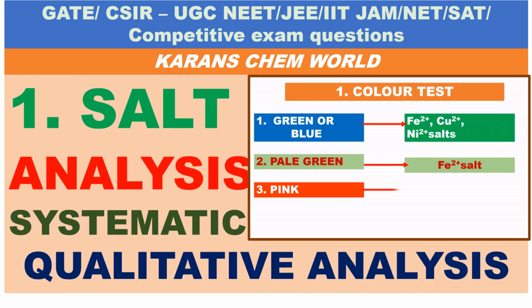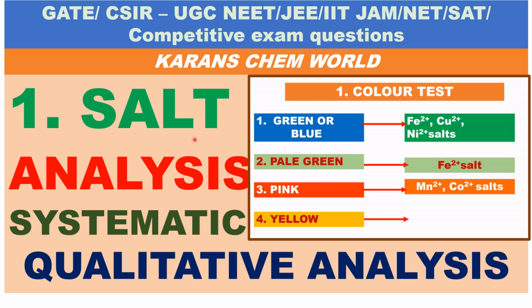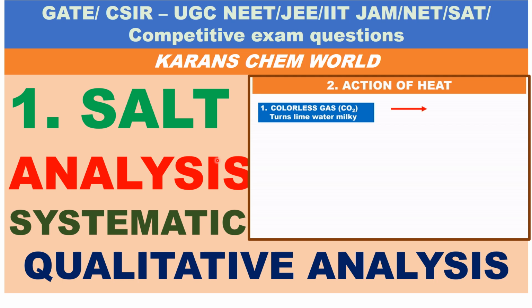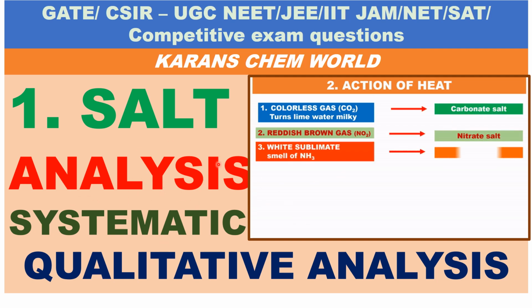Today in this video, let us discuss salt analysis, systematic qualitative analysis. We'll see the first two tests in this video.